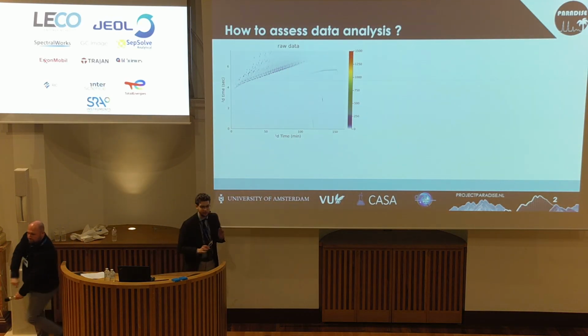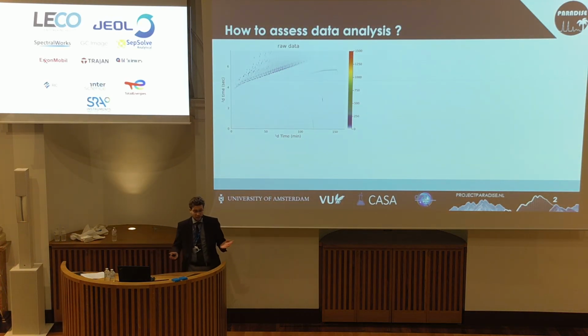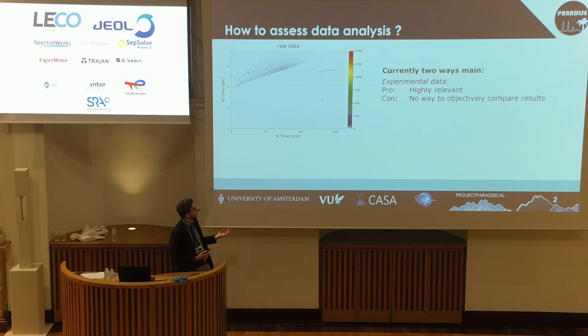Okay, cool. So, as you all know, we have many ways of assessing our analysis. We can use internal standards or we can use external calibration, but it's much harder to assess how we're doing in terms of data analysis. So in general, there's sort of two approaches you could take. You could use your experimental data, which is of course the most relevant thing you can have. However, it requires quite an expert view to assess it, and even then it's a subjective assessment at best.